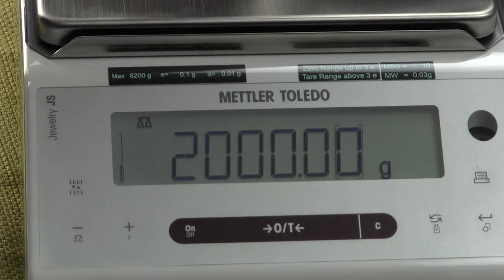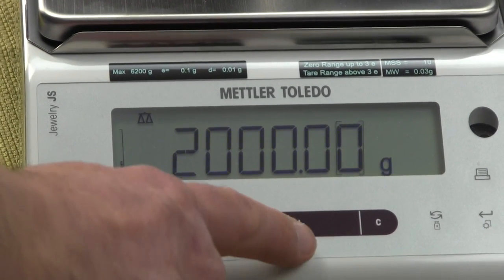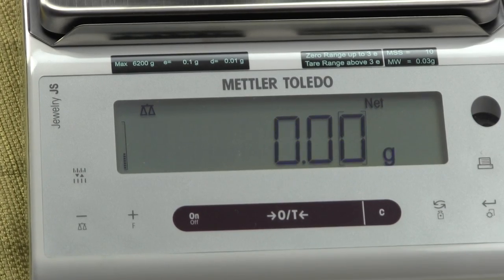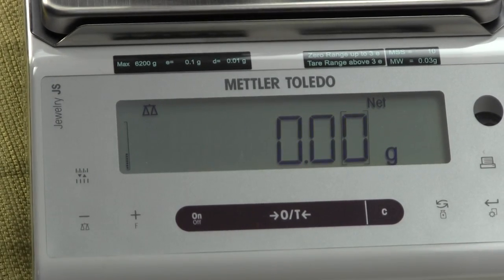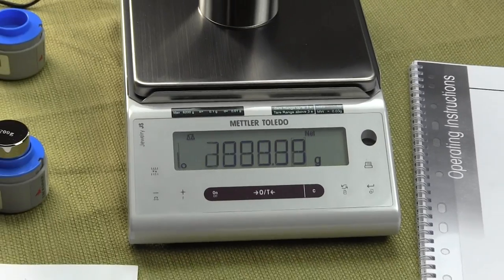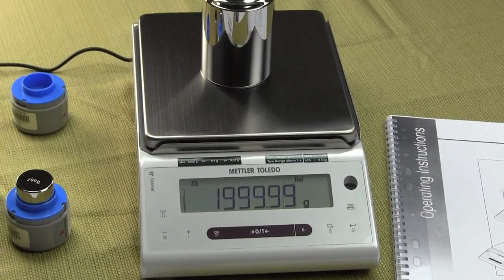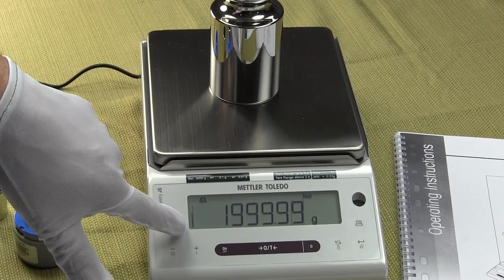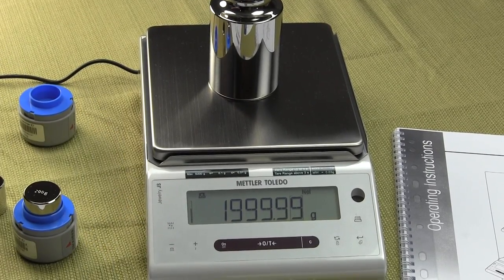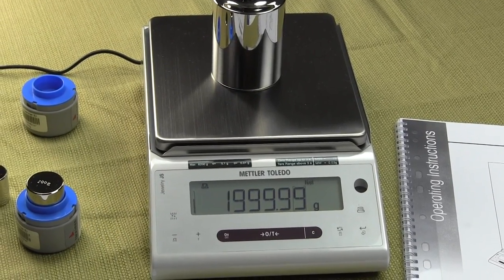But this fill guide is nice and an example where it's really useful is if you were taring out something. Say this was a container and you wanted to tare it out, the balance would go to 0.00 and if we put on another 2000 grams, the balance has 2000 grams on the balance. But you'd look here, the fill guide gives you some idea exactly how much weighing capacity you have left.